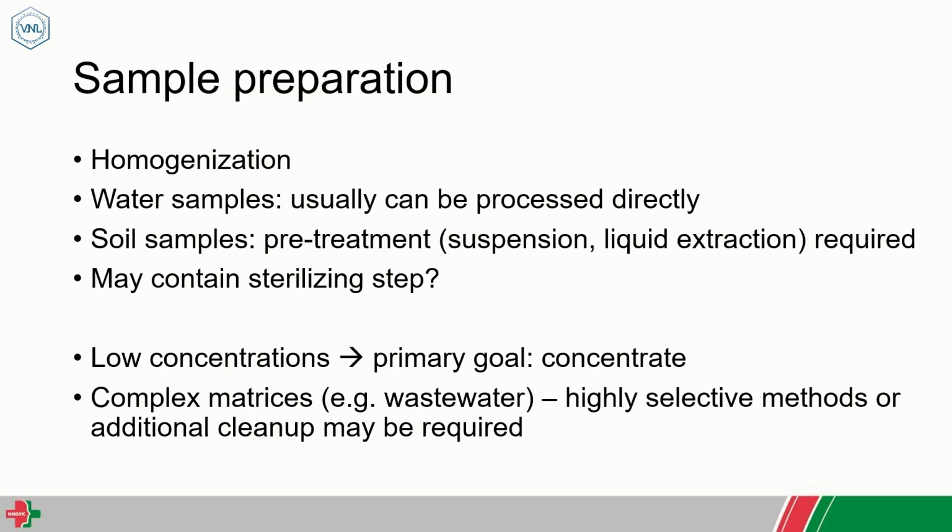As I have mentioned in these examples, the appropriate protective equipment or the attention to vulnerable staff members can be vital in these cases. And in general, how do we do sample preparation of environmental samples?